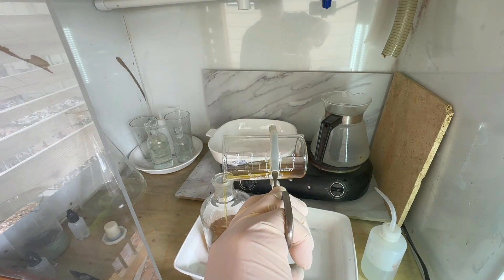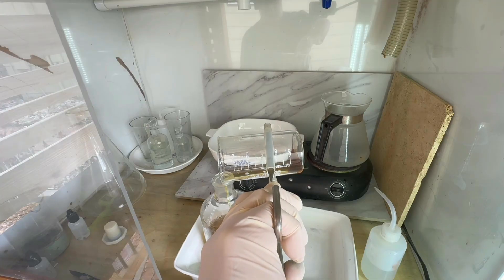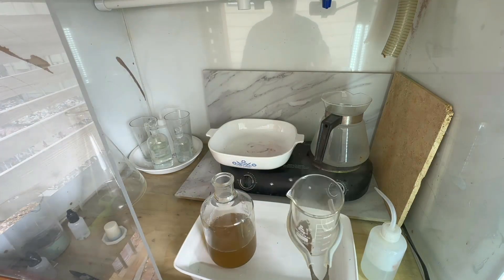That powder in there is looking really good — nice light color. I'll finish up the washing and get it dried.